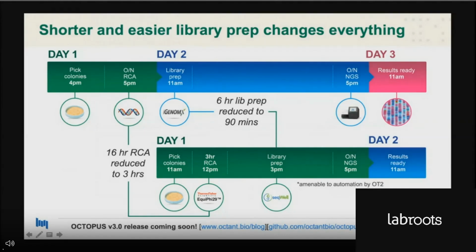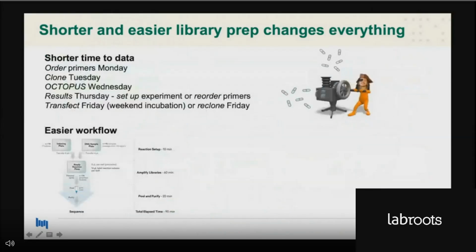Yeah, I mean, this is crazy, right? Like, it's literally faster than Sanger. And as Bryan mentioned, we're going to be releasing these protocols soon. Just be on the watch out for that. We haven't actually written everything up yet, but it works. It's awesome. And so this changes everything for us. It's basically taking a 2-day process to 1 day. This dramatically shortens time to data, right?